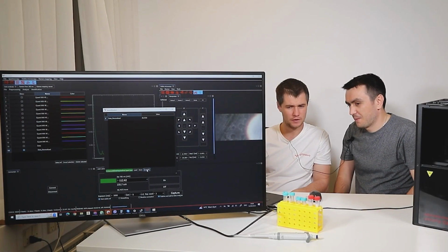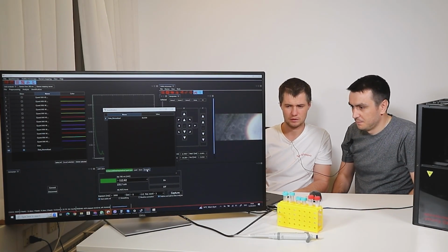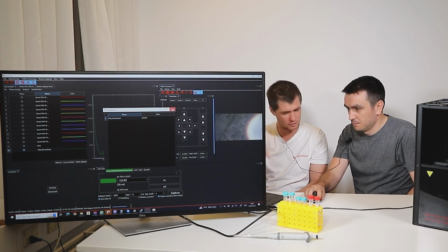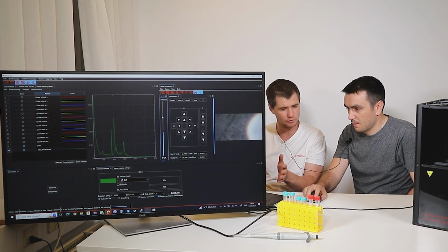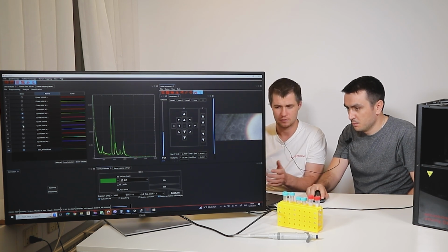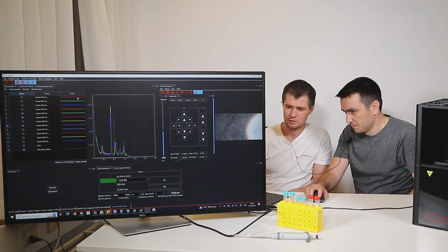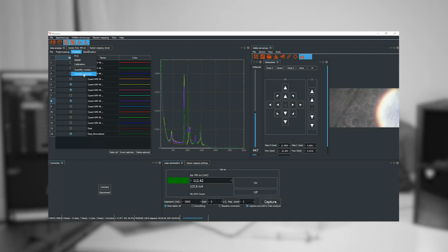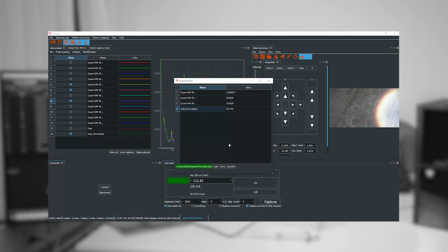And if I want to quantify more than one sample, like, I measure a lot of samples, the rest of the multi-well points, and I want to quantify all of them together and save, you can check several spectra, go to quantify selected. Select it, and it gives the concentration for all of them.